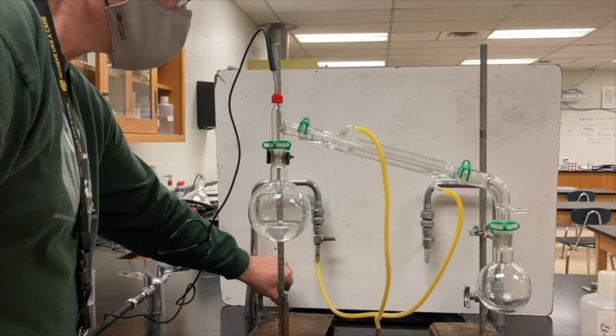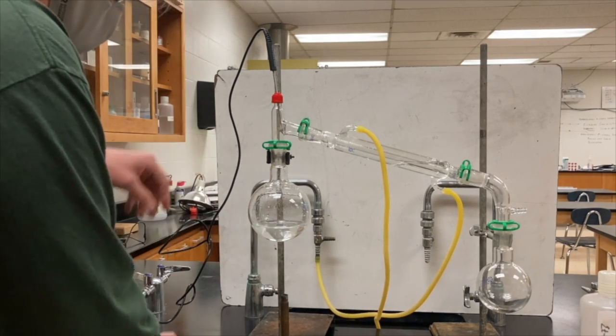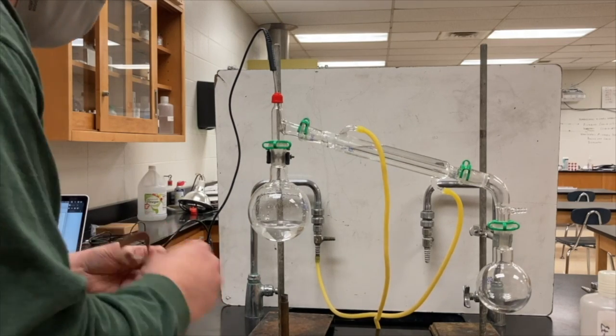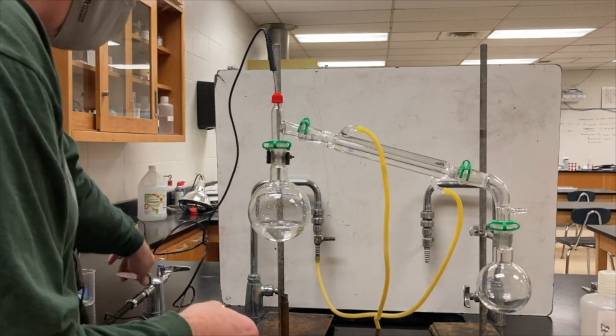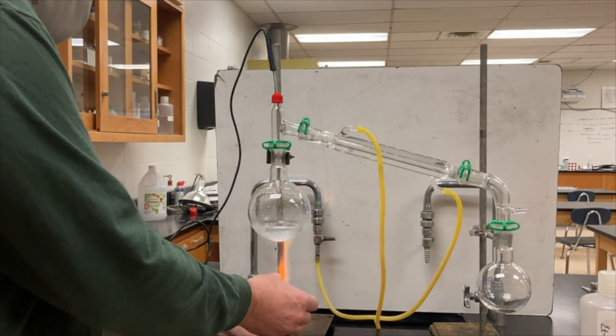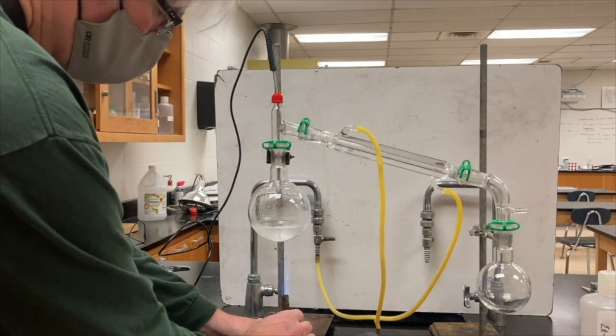Turning on the water, and now you can see the water jacket around the condenser beginning to fill up. So that'll cool off the condenser tube that runs inside there and cause condensation of the liquid that boils off the large flask.